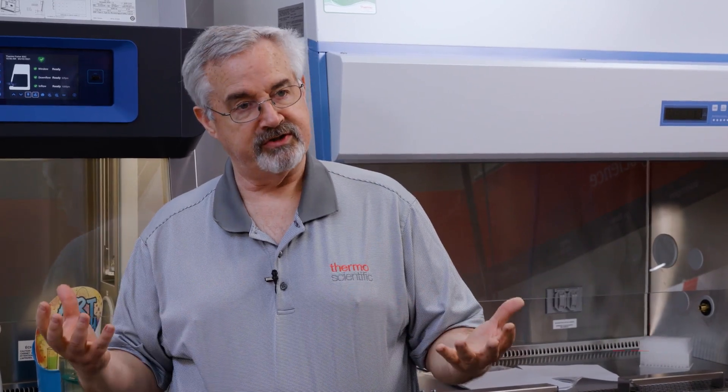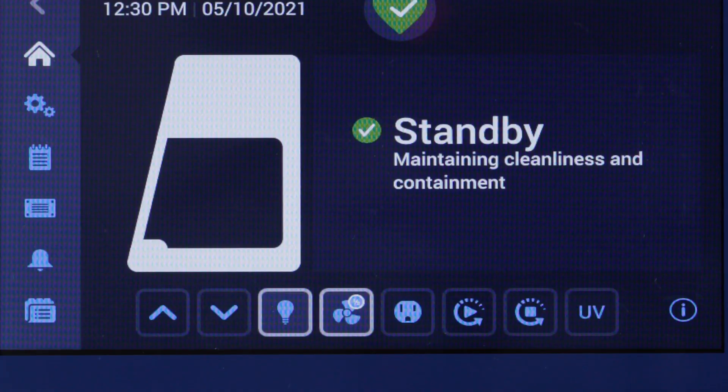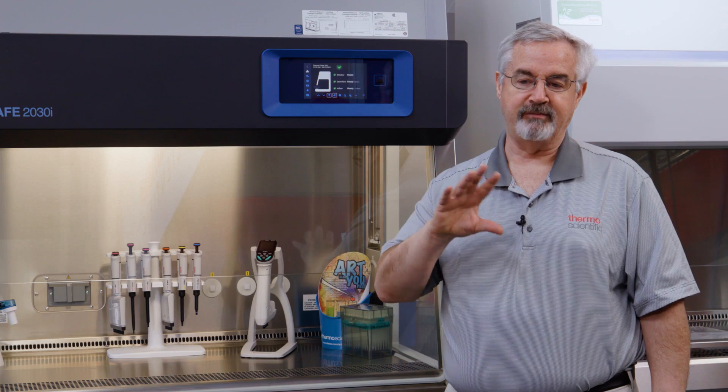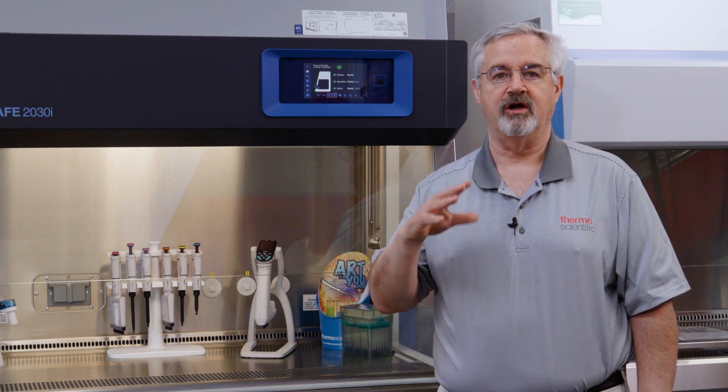As far as cost, this cabinet is even more energy efficient than before — 35% less energy consumption in operating mode and 20% less in standby mode. But really, this cabinet adds efficiency through communication. In the past, cabinets could be difficult for some users to understand when there's an airflow alarm, a window position alarm, or something else — and even more so, what they needed to do in response.